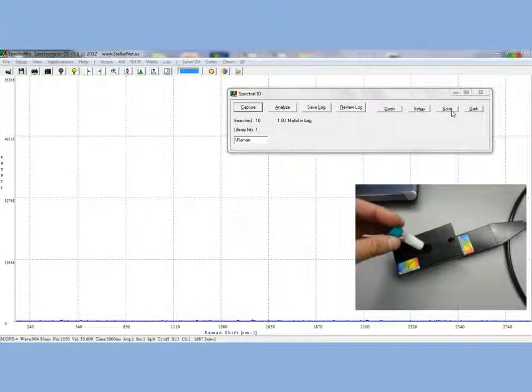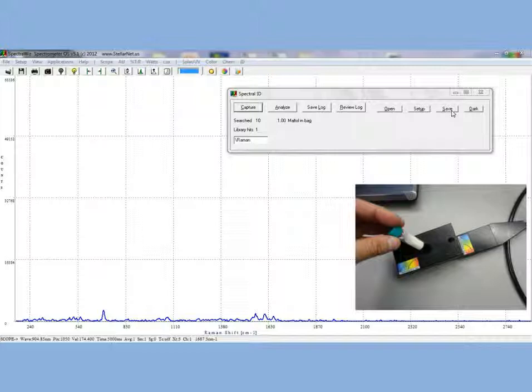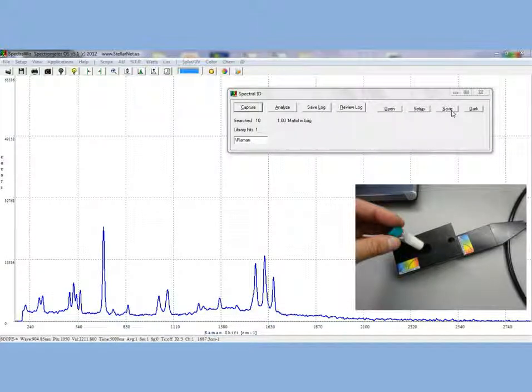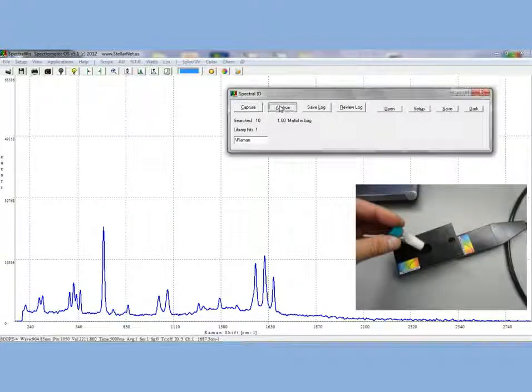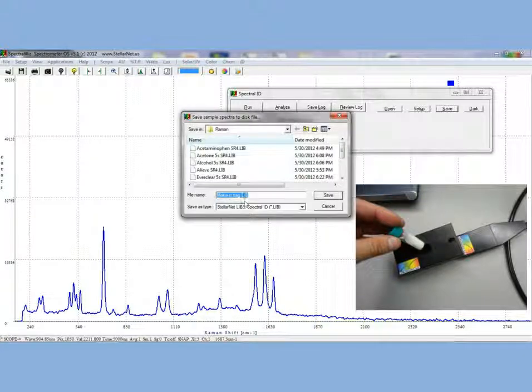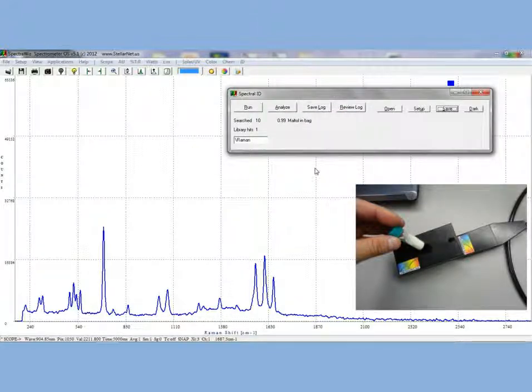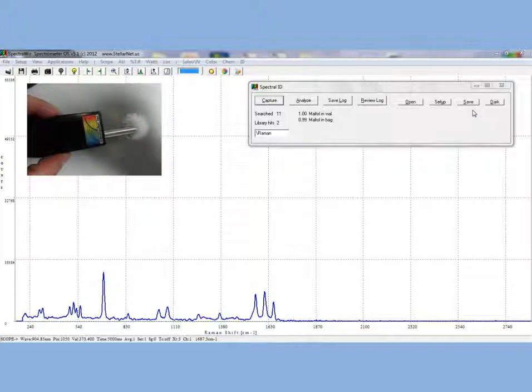For the next application, we are going to measure maltol in a vial and compare it to the maltol in the bag spectrum that we just took. Place the vial inside of the Raman probe vial holder and press the red laser button and wait for spectral acquisition. We get a very similar spectrum as before. We will go ahead and save this maltol in a vial spectrum. Now when we click analyze, we see a 100% match for vial and a 0.99% match for maltol in a bag.